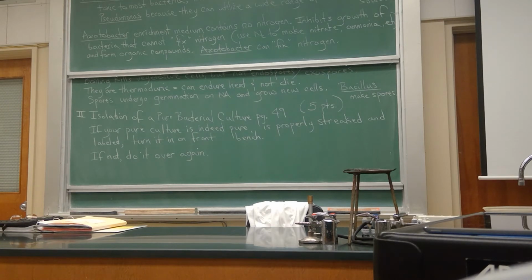Did you label it up? Because I labeled mine unknown. Number 26. You didn't write it? Oh, there it is. No, we're not doing the morphological unknown. We're doing the Serratia?